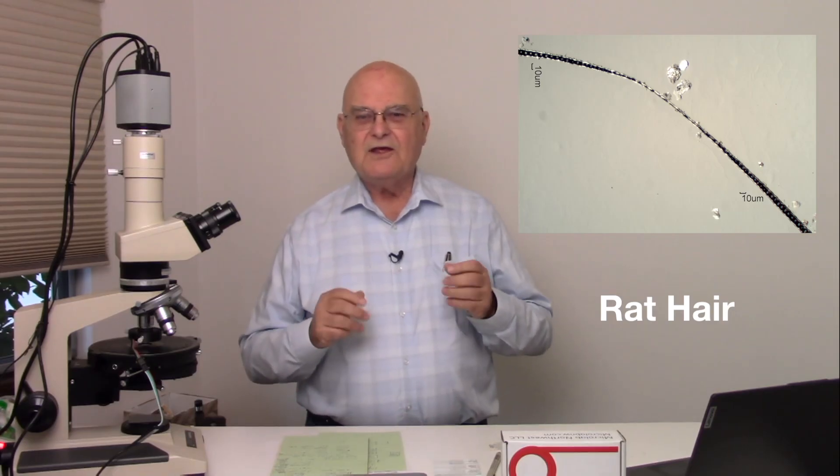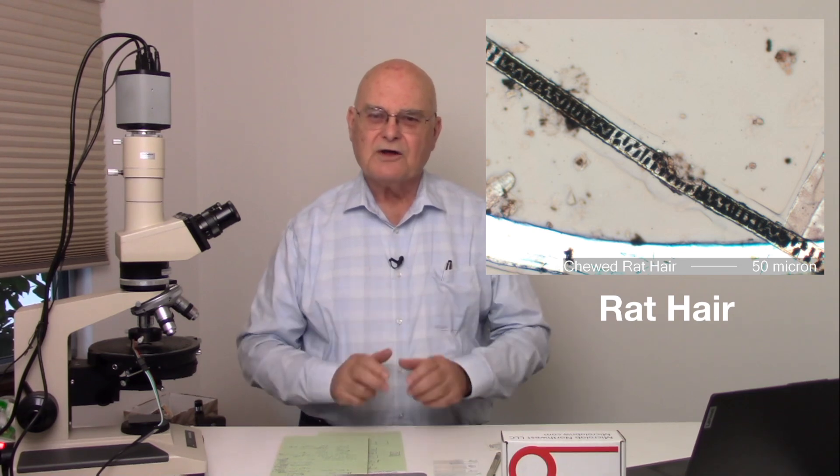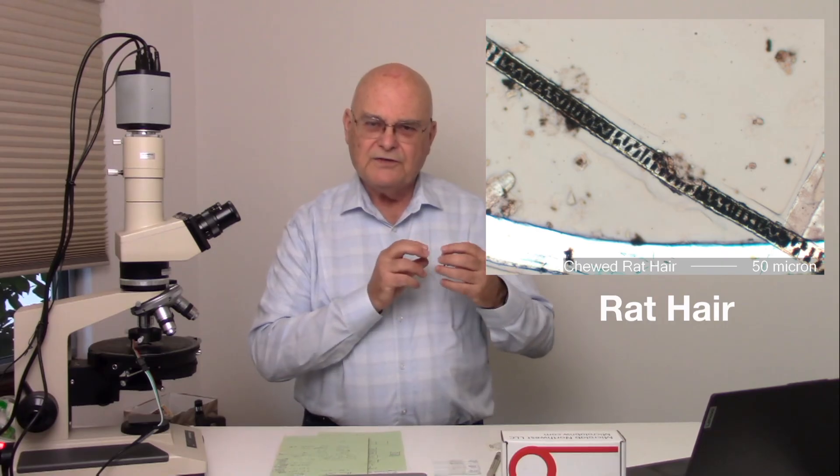Occasionally, we'll even see hairs from bats or rodents. Rodent hair has some nice characteristics. The pigment tends to concentrate in the center part of the hair, in what's called the medulla. And as you can see here, we have clumps of pigment in the center part, the medulla of the hair. It's very characteristic of rodents of all types. Rat hair has specific characteristics, as do mouse hairs. They're all going to be slightly different, but we can identify them.